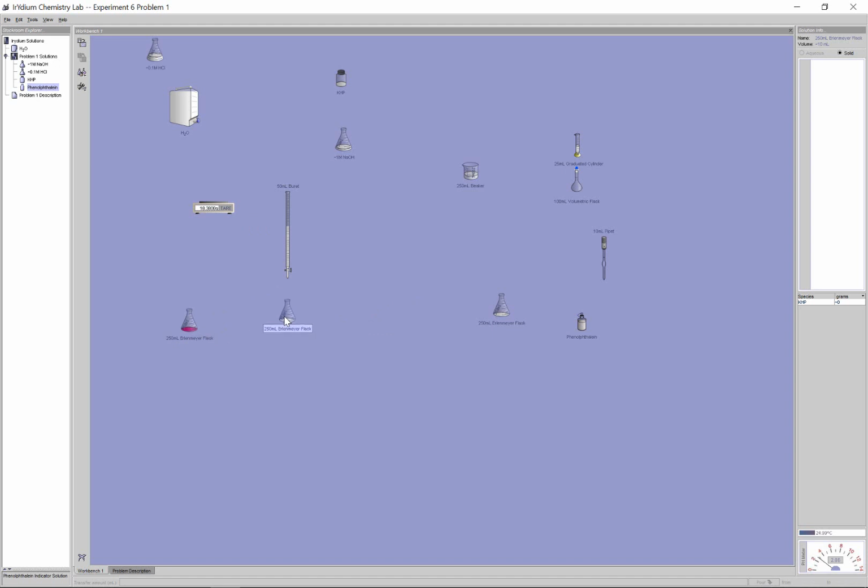I'm going to pull my next solution out here. Because I have enough burette volume inside, I don't need to refill yet. I'm going to take my 21.23. I'll do it without error here just so that it's more simple here. I knew the first titration took about 10 milliliters here. What I can do here is open the burette. I can very safely toss in, I don't know, 7 milliliters because I know I have upwards of 10 before the acid runs out. So I'm just going to pour in 7 here.